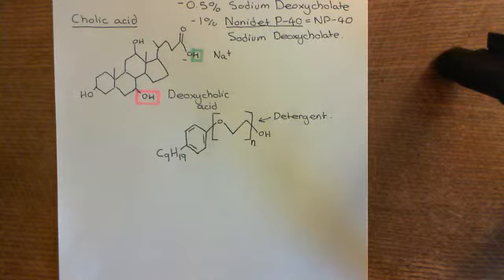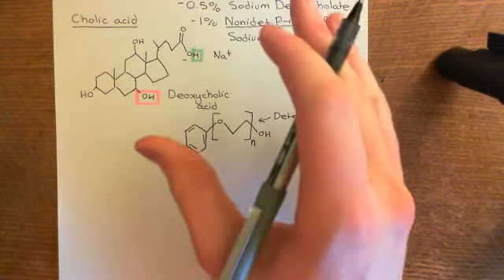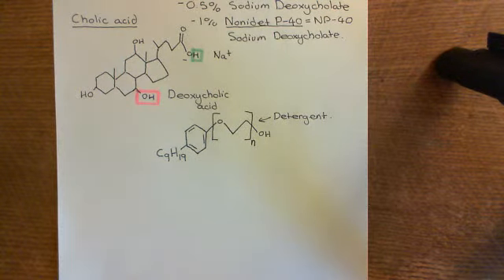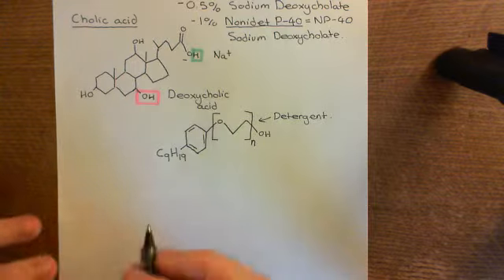Right, so this now concludes our discussion of the cold lysis buffer. So that's all of the things that you'll have within this cold lysis buffer. What this will do is it will lyse the cells, so all of the membranes will break down and everything will just be released into a gloop. What you will then do is take this gloop and you will centrifuge it.